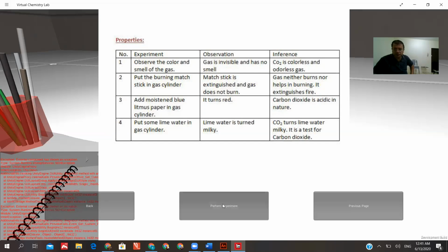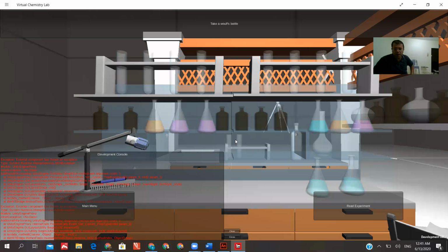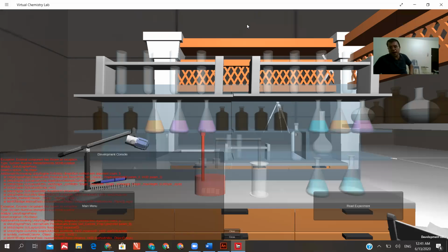Now go to your experiment. Now you are inside your science lab. In this virtual lab, you will only see the steps which will take place. A specific bottle is needed, this one. I'm going to add the marble chips in this one. And then I'm going to arrange the tubes to collect the carbon dioxide gas, which will be collected by air displacement, downward delivery, this way. And the final step is just adding the acid. Once you add the acid, effervescence takes place and the carbon dioxide gas will be collected in this bottle. Now you have the carbon dioxide gas, you can complete your experiment.